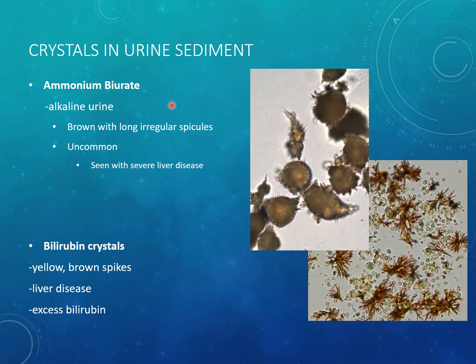So they are urate crystals, remember? And we know that Dalmatians can't break down urates, so these are also common in Dalmatians. They're frequently seen with amorphous crystals. They can be associated with portovascular anomalies. So again, they're common in Dalmatians because they can't break down those urates, and also in English bulldogs.